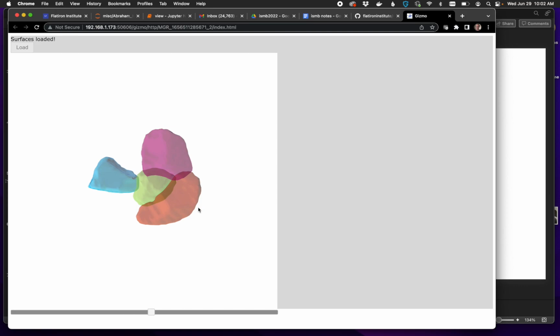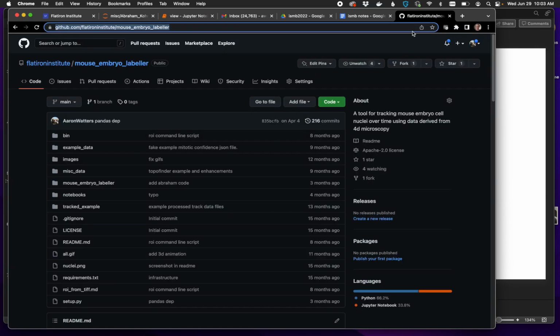The lineage 3D viewer provides a detailed geometric view of the cell lineage progression and allows the analyst to examine the geometric structure relationship between the cells and the embryo by rotating and zooming. The viewer does not start automatically, but prints a start URL, which we can direct to the browser of choice. There are other start methods which open a new browser frame automatically. The lineage viewer requires a pre-processing step that extracts the isosurface geometries from the cell structures in the segmentation volumes. This preprocessor uses JavaScript and WebGL to extract the isosurfaces. So now I'm going to stop this interface.